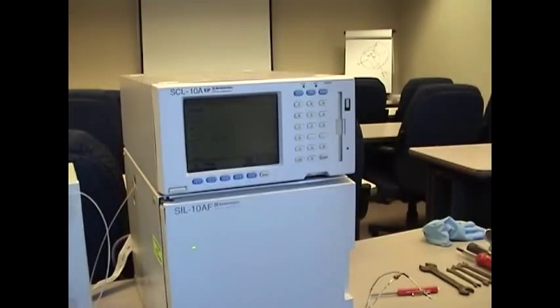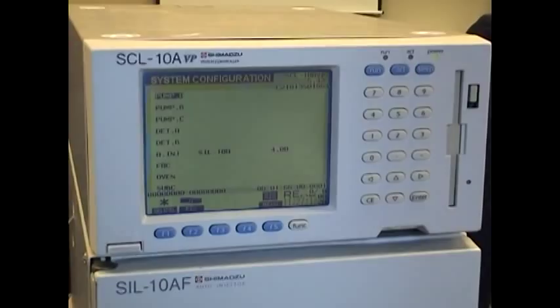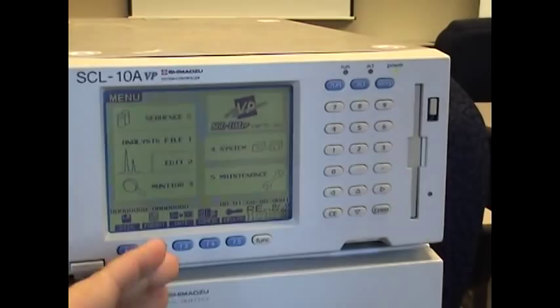When the controller is done initializing, you'll see the extra characters indicating that you're in service mode. You'll start by hitting F5, which will put you in the menu. This will be the main screen. You'll hit zero for sequence.